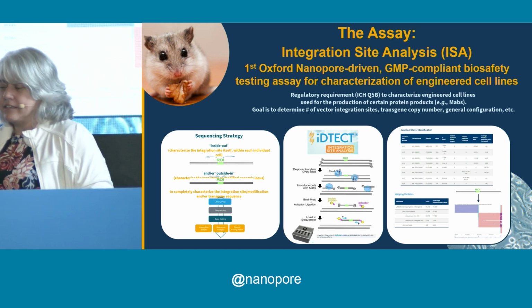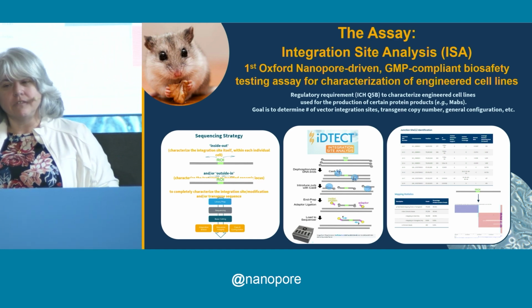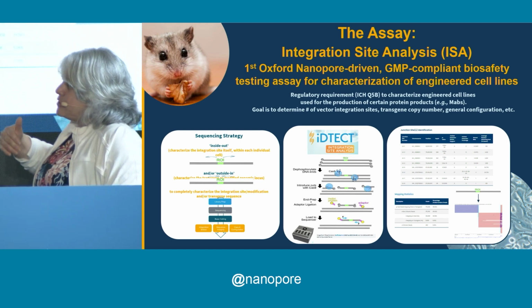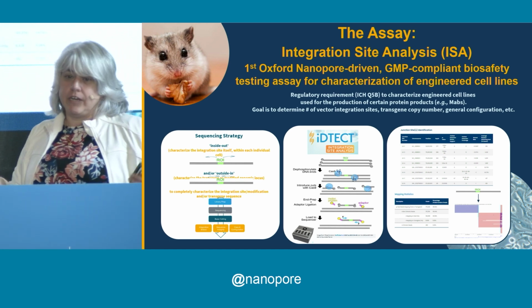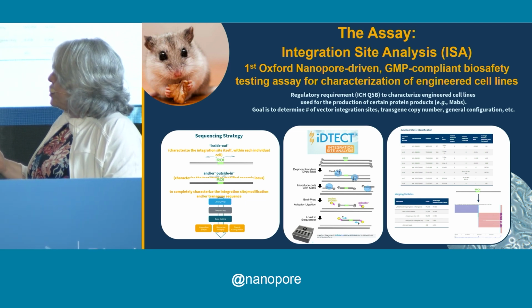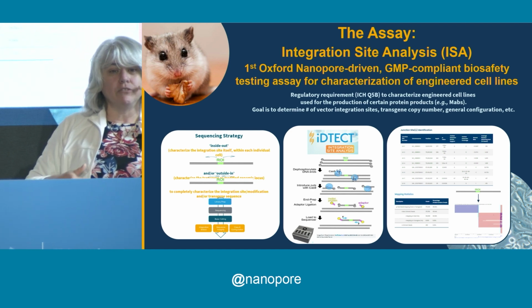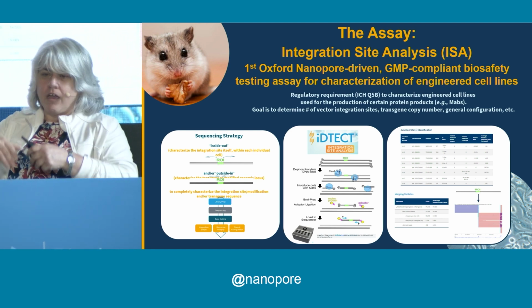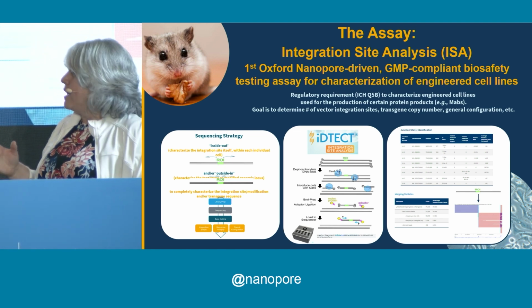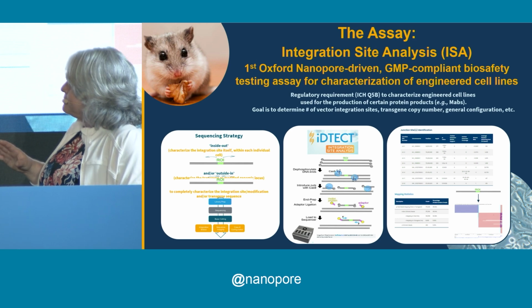So there is a guidance document out there, which is the ICH Q5B. Unfortunately, I know these numbers and letters now very well. It's a guidance document that says that if you're manufacturing, particularly a monoclonal antibody, that you use a Chinese hamster ovary cell or system to develop it in, you want to characterize where it is in the genome so you know where it is, how many copies are there, what the configuration of the copies are, and all of these other elements that you can use a whole series of classical testing to do. And there's like 7 tests to do, not always ideal.